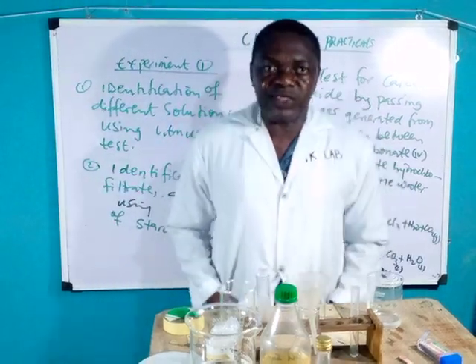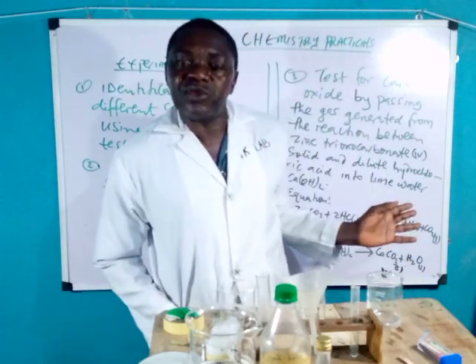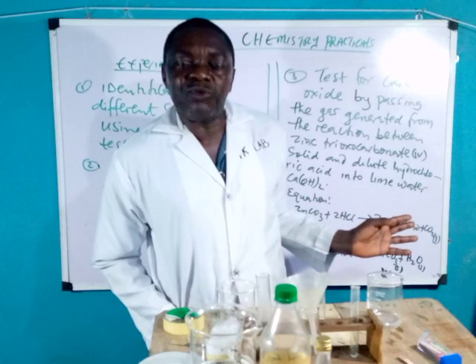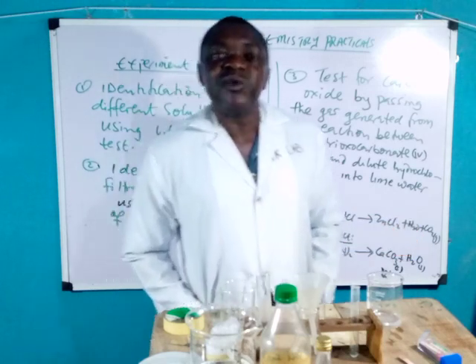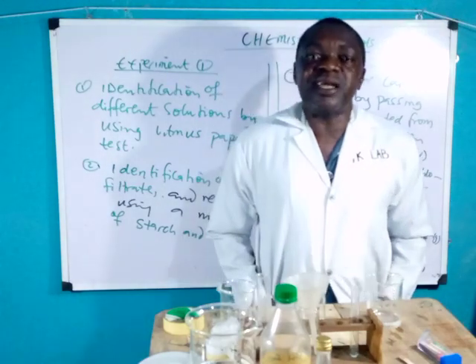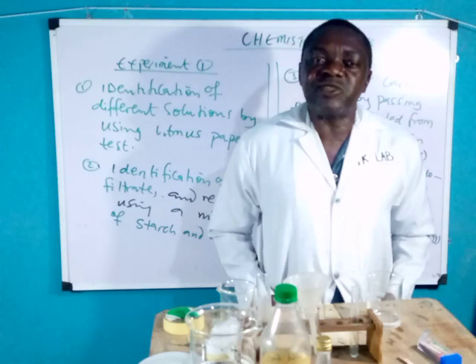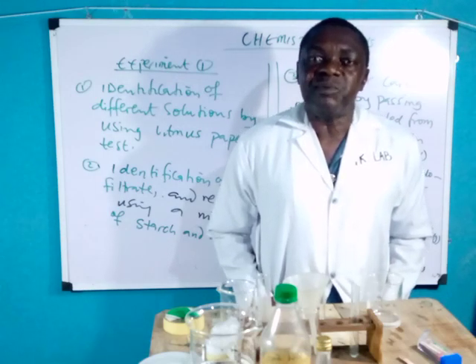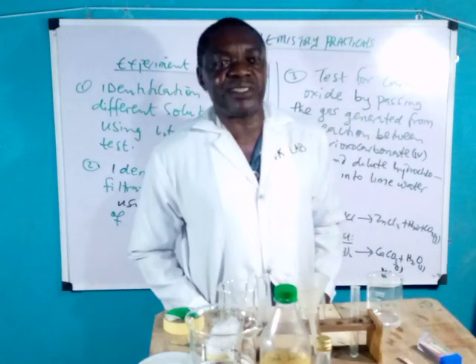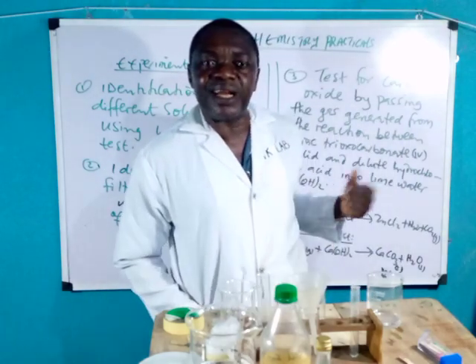As I would like to inform you, most of these tests are what you need to know. They are what you need to have as your first-hand knowledge before you go into real salt analysis. For example, for the test for carbon dioxide, it is expected that you must have had previous knowledge of it during the classwork experiment, because when you are writing your external exams, maybe WAEC, JAM, NECO, nobody is going to allow you to carry out this test in the lab.